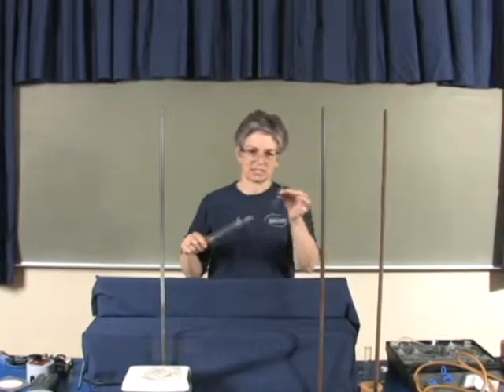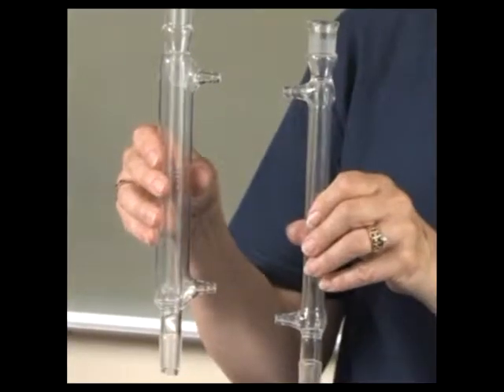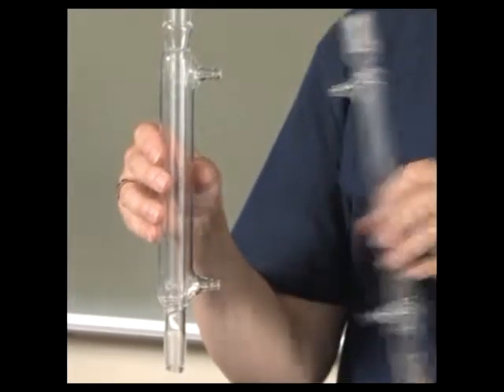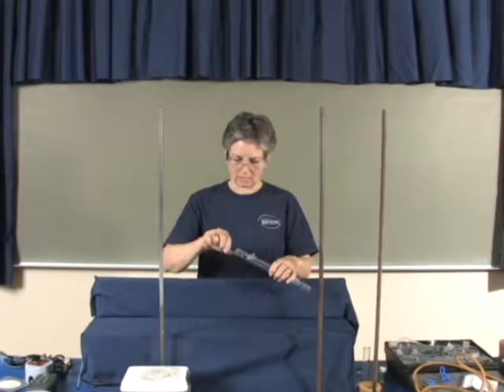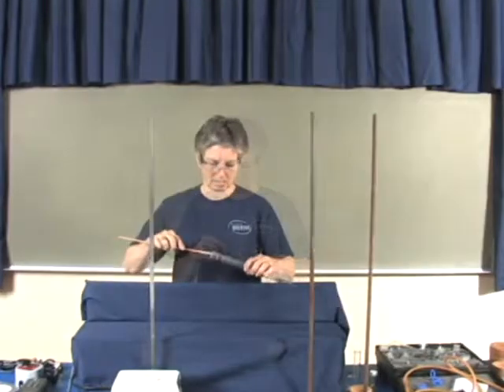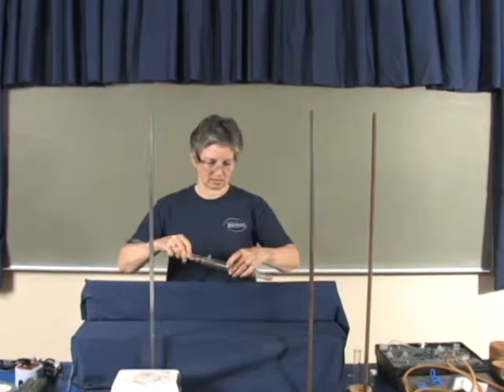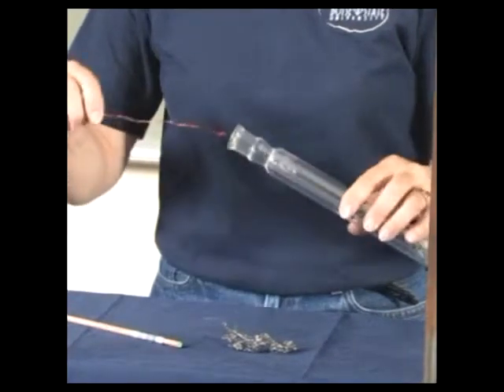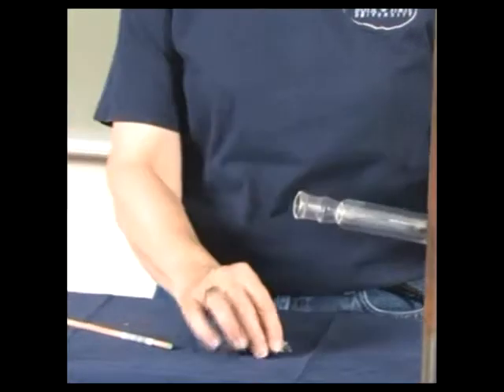For a fractional distillation, the first thing you have to do is pack the fractionation column with steel wool. The fractionation column is the larger of the two condensers in your kit so that it will hold the steel wool. You feed the steel wool down through the top. There are dimples at the bottom that hold it in place, pushing it down with a stick or a wire. And you can use a wire to stretch it back out if necessary.